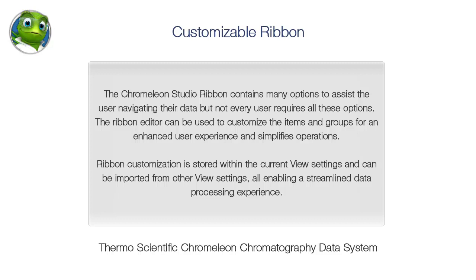The Chromelion Studio Ribbon contains many options to assist the user in navigating their data, but not every user requires all these options. The Ribbon Editor can be used to customize the items and groups for an enhanced user experience and simplifies operations. Ribbon customization is stored within the current view settings and can be imported from other view settings, all enabling a streamlined data processing experience.